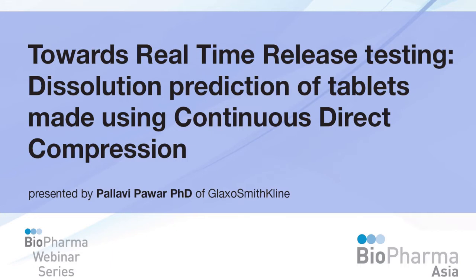She received her PhD in chemical engineering from Rutgers University in May 2016 under the guidance of Dr. Fernando Muzzio. Her thesis focused on tools for real-time release testing in batch and continuous tablet manufacturing. In it, she investigated non-destructive methods like near-IR spectroscopy to predict process and product performance, blend and content uniformity, hardness and dissolution of tablets, and compared this approach to traditional testing in both batch and continuous manufacturing mode. Her expertise is in powder handling, material characterization, and powder processing geared towards direct compaction of tablets. She has worked with batch and continuous unit operations, including powder mixing, powder feeding, twin screw granulation, fluid bed drying, milling, and tablet compaction. She completed her bachelor's degree in chemical technology from the Institute of Chemical Technology, Mumbai in 2010.